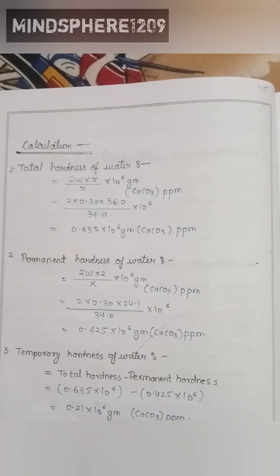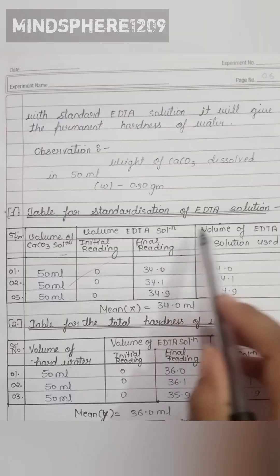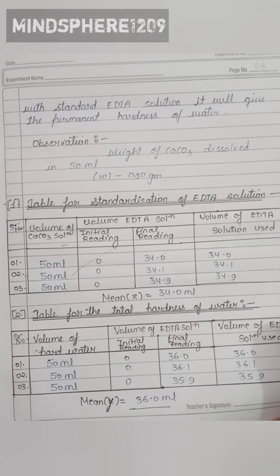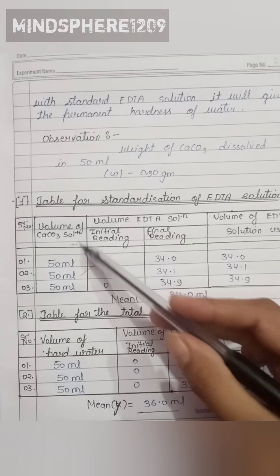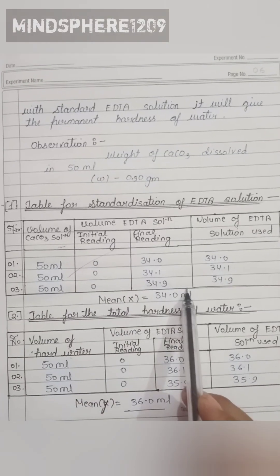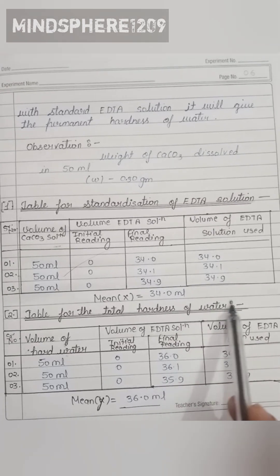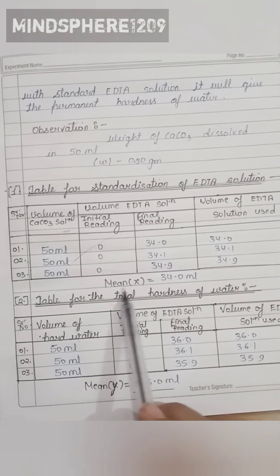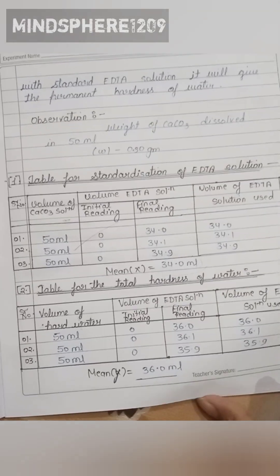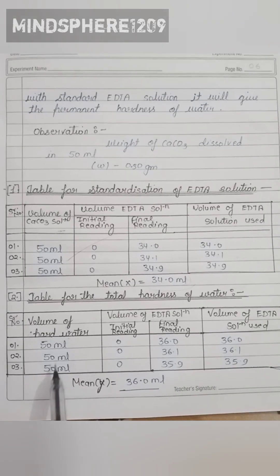This is the observation table for standardization of EDTA solution. We record the volume taken, initial reading, final reading, and volume of EDTA solution used. The mean volume is 34.0 ml.